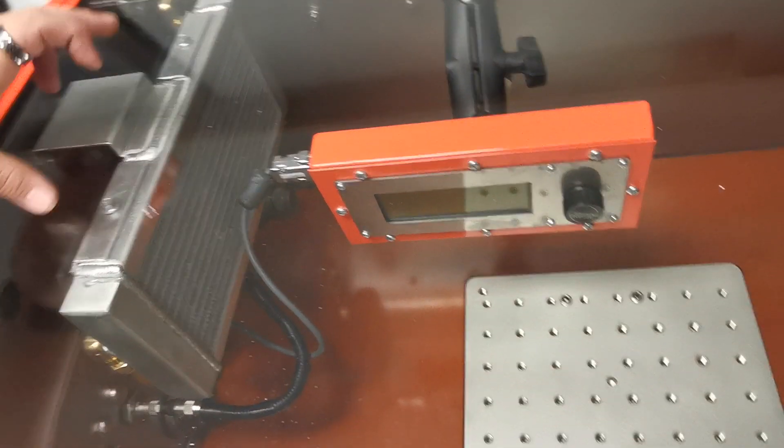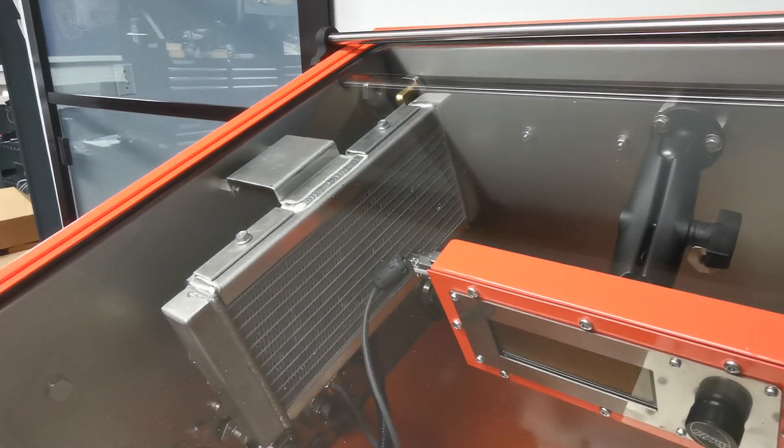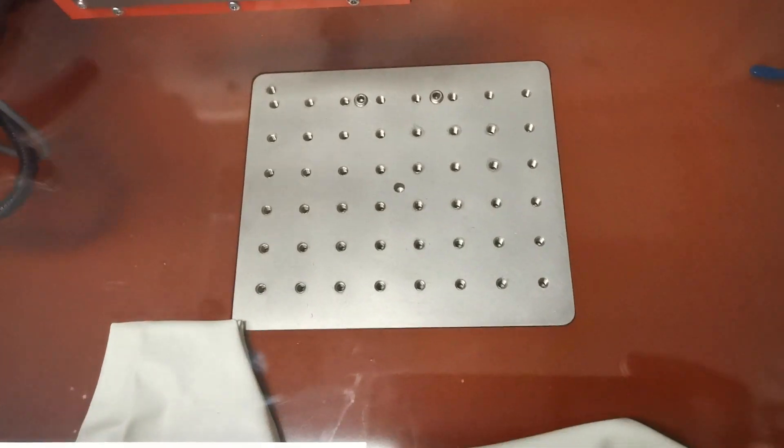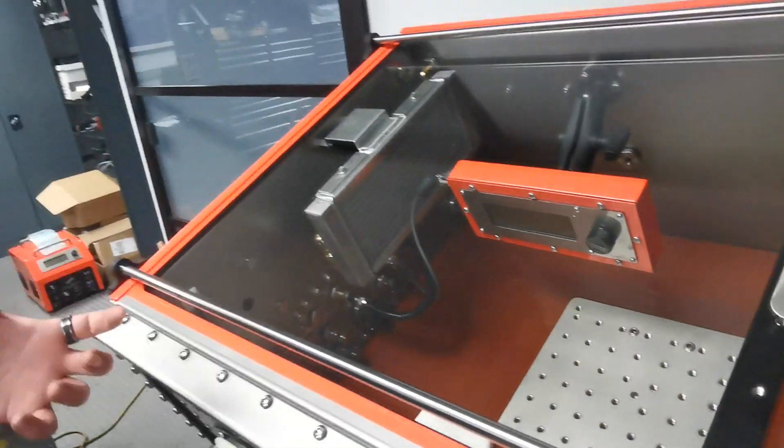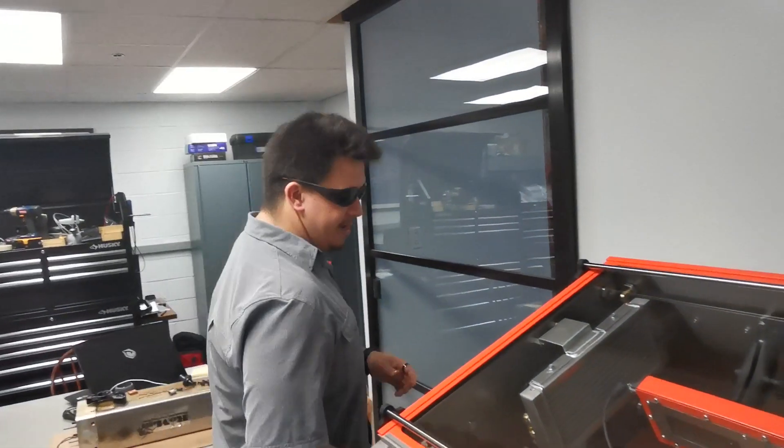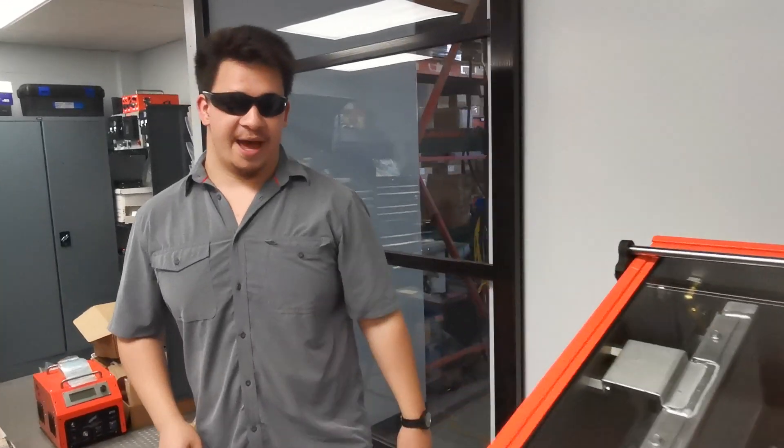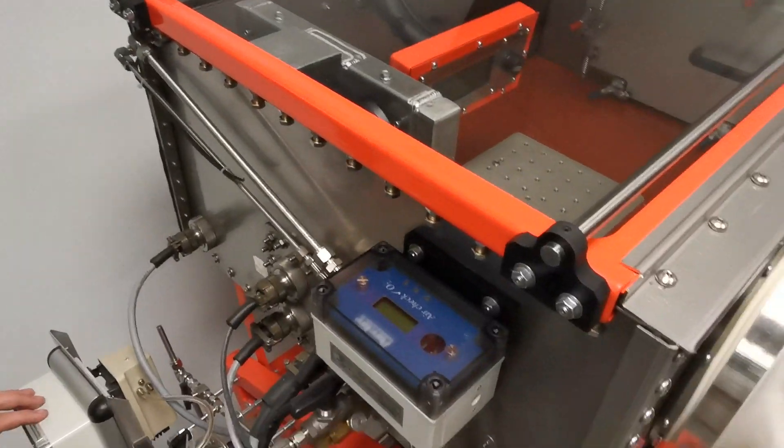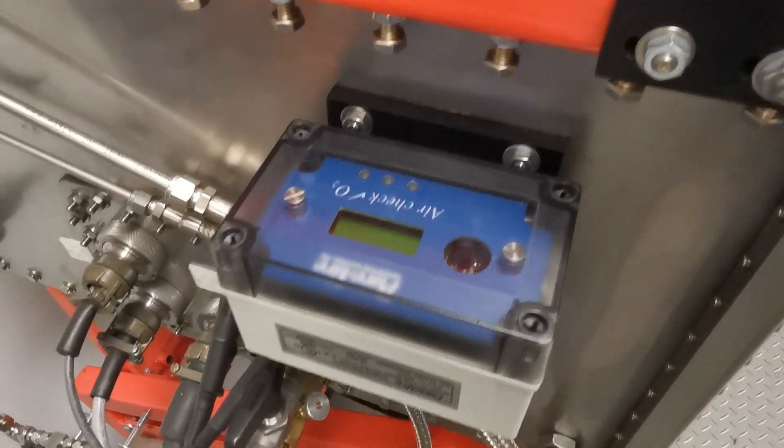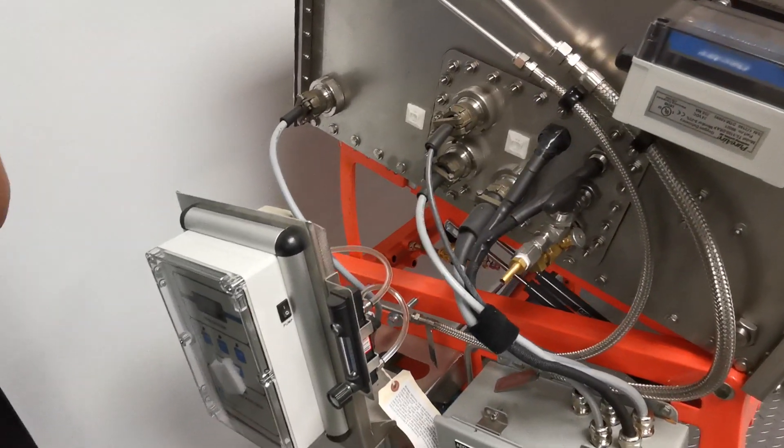We have a cooling system that maintains the temperature inside the box as well as the temperature of the substrate block as well as the temperature of your applicator. On this side you'll see that we have multiple different levels of oxygen sensors, so this controls solenoids that control be it argon or helium gas in as well as control the anti-chamber.